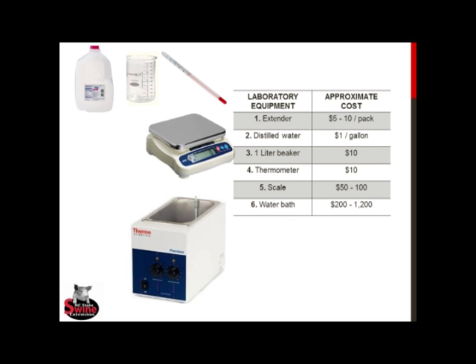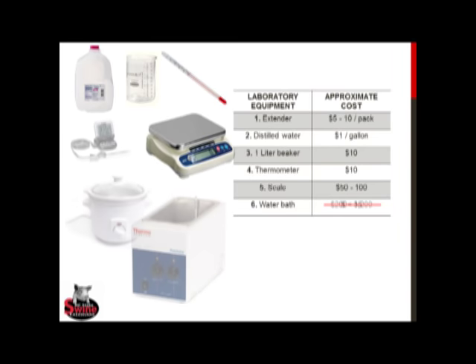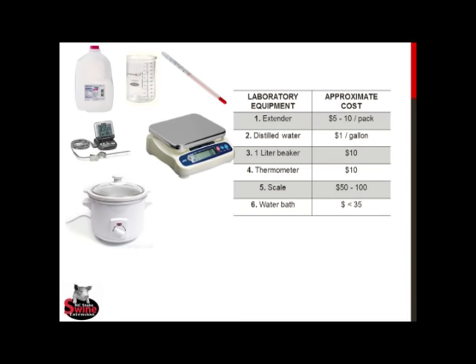Next, we need a means of warming the extender to 99 degrees Fahrenheit, which is the temperature we need the extender to be at before we can add it to the semen. Generally speaking, commercial water baths will do the best job of maintaining the extender at the right temperature, but even a small water bath may be prohibitively expensive. In its place, a crock pot or metal pot placed over a hot plate or stovetop burner might be a suitable alternative, provided they can hold the desired temperature.